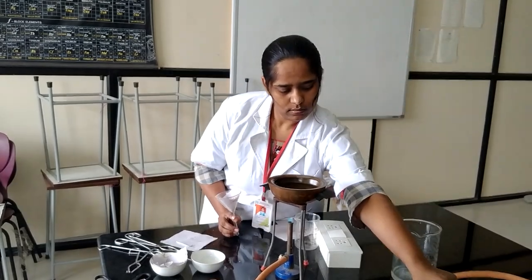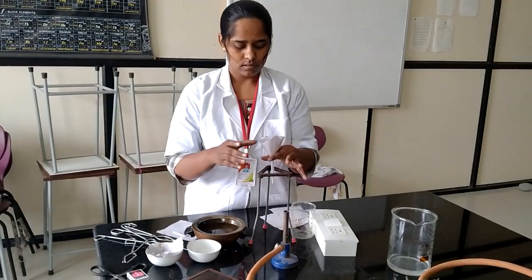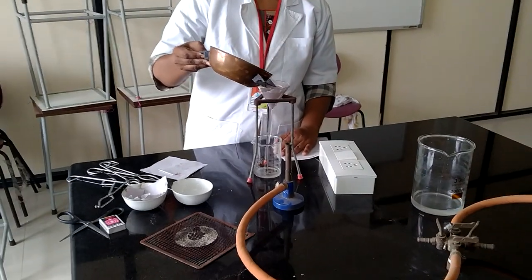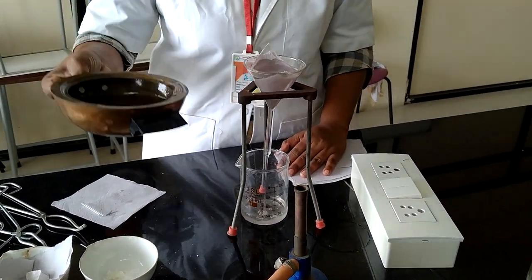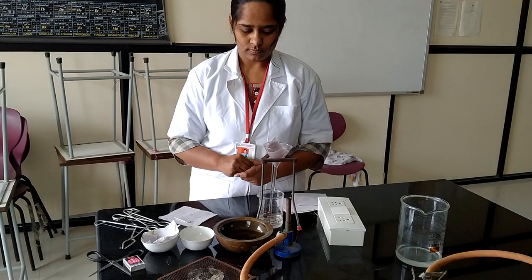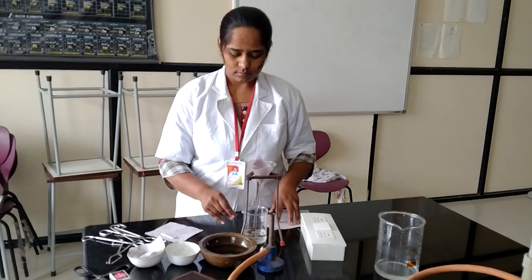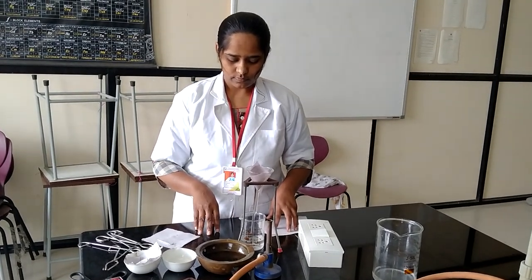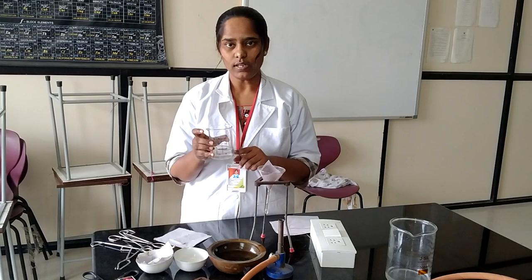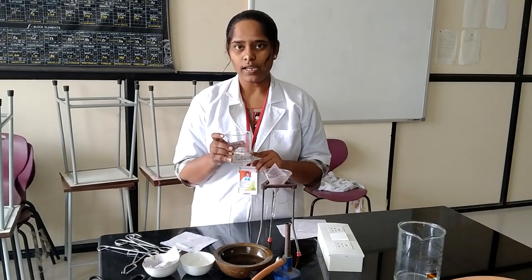After filtering, this filtrate — this solution — is known as sodium metal extract solution. This is used for the element detection of different organic compounds.